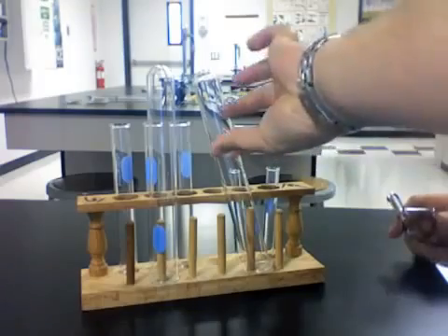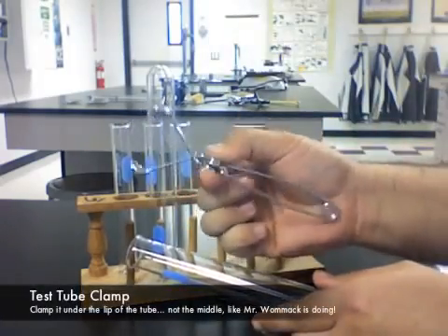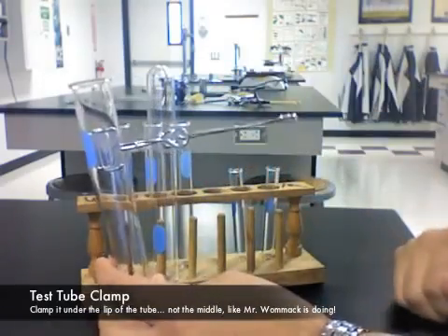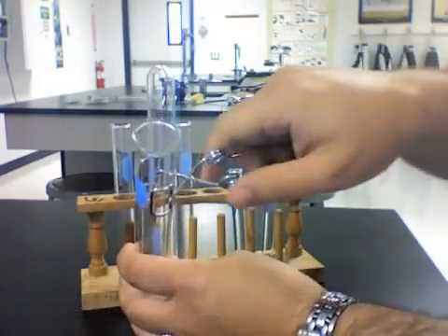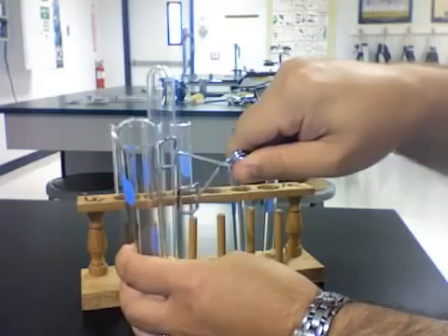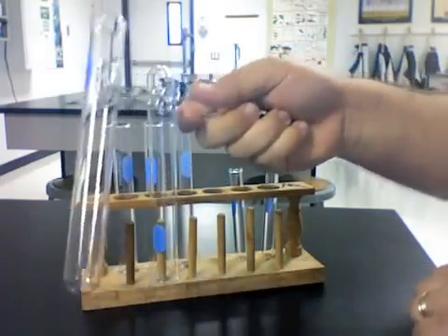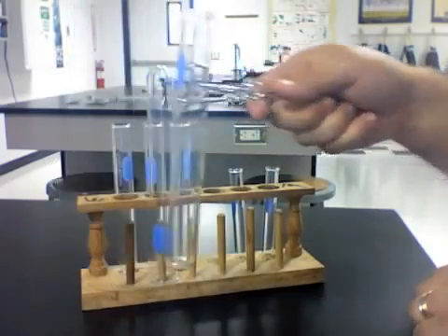So we have the test tube rack, we have the test tubes, now we have a test tube clamp. Test tube clamp will clamp around there. We actually are not squeezing to clamp it on there, it's spring-loaded. So when you squeeze it, you release it. Squeeze, release, and you have it. And so that way your hands are free to move around, and you can hold this in the Bunsen burner fire or do whatever you need to.